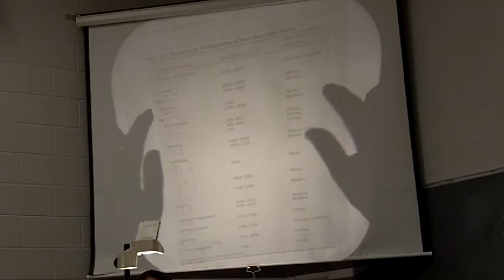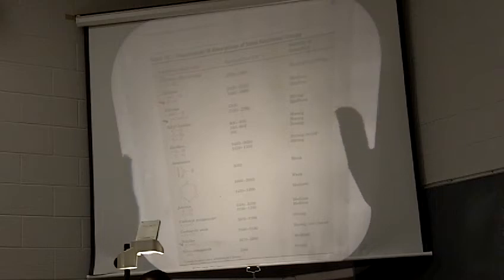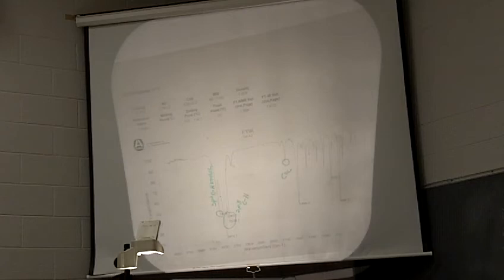The other table that you have available to you is in your textbook. The difference between the two, the yellow sheet gives kind of more general, broad regions for each of the functional groups. There's more specifics on the table 12.1 that's in your textbook. Okay, so you've got two resources for you: textbook and this. All right. Okay, I'm going to just show you so you guys can see examples of different spectra.